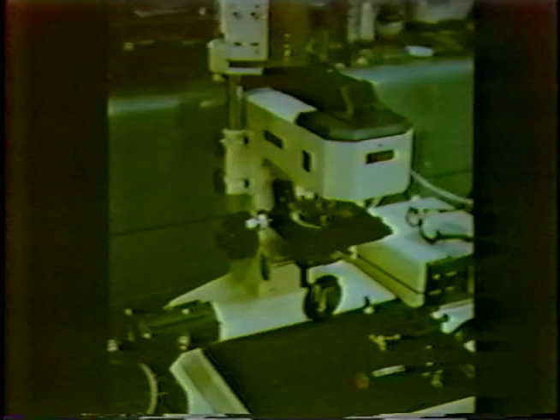And using that configuration, not the same specimen, here is a specimen of muscle stained with silver cholinesterase to demonstrate these muscle end plates, using the tandem scanning microscope to illuminate the specimen in transmission. This is the non-confocal image, and we could see at the same time, looking through the TSM, this reflection image from the same preparation. So we could look at both sides of the specimen at once in the TSM.